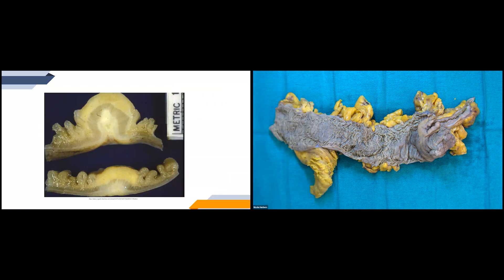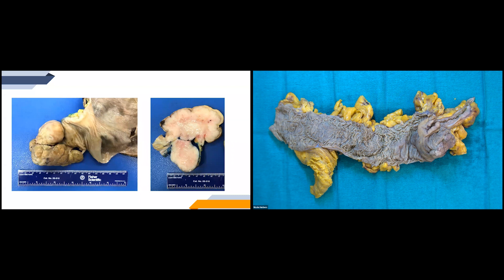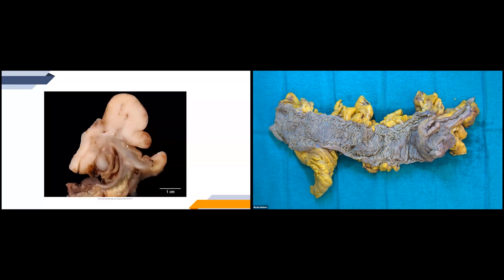This one is a leiomyosarcoma that I actually grossed earlier this year. You can see with the cut surface it's very white, kind of pink and fleshy in appearance — a lot different than those other two we just saw. So when you have a cut surface like this, you want to be thinking this could be a leiomyosarcoma. And here's our last gross feature picture: a lymphoma arising right at the ileocecal valve. You can see that white homogenous mass beginning to grow right at that intersection.